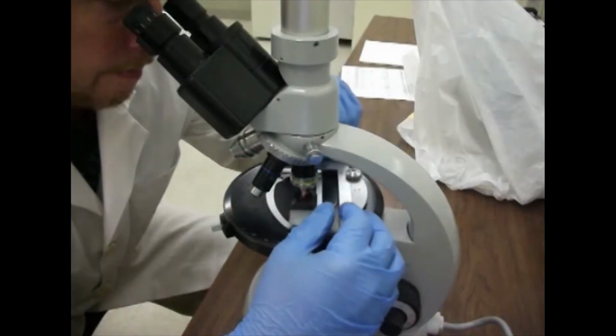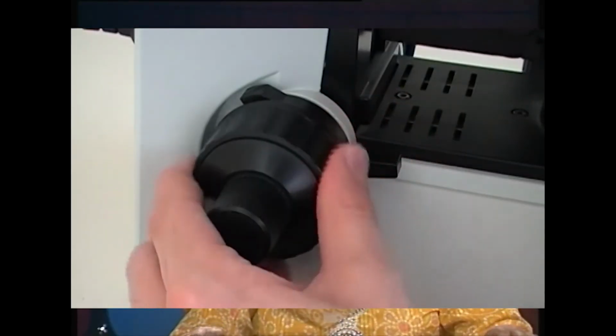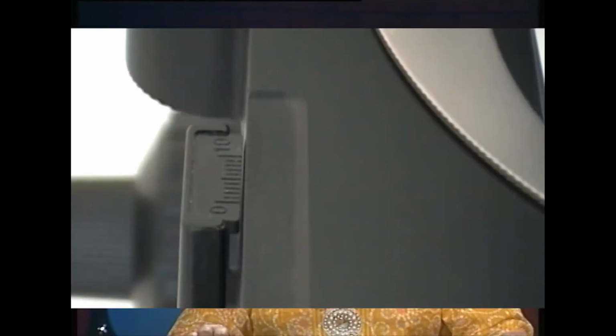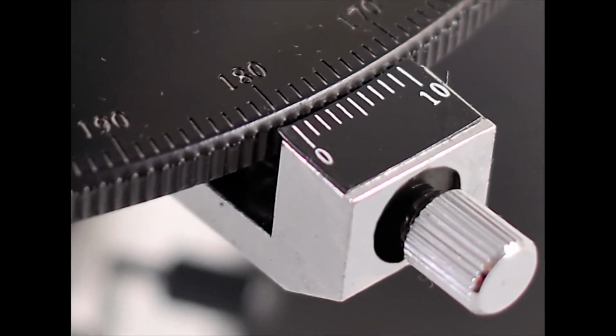For accurate work, the objective should be centered. Centering means making the center of rotation of the stage coincide with the axis of the microscope, which is the intersection of the cross wires. Two screws are provided in the objective collar for centering the objective, and these are called centering screws.